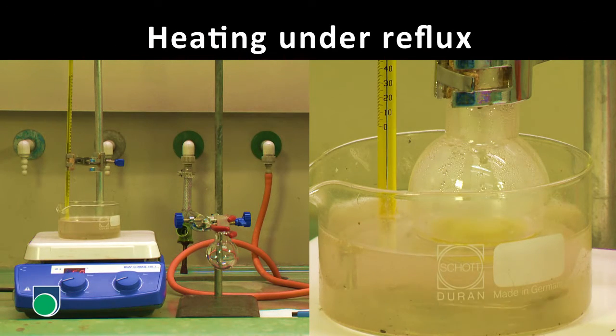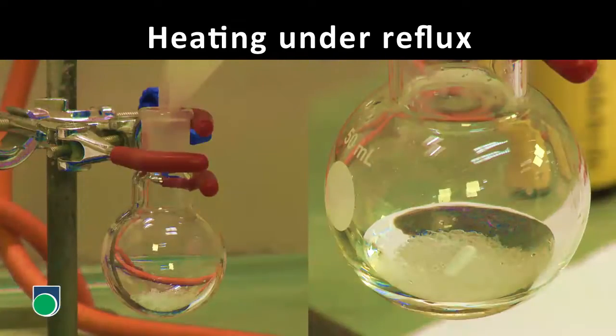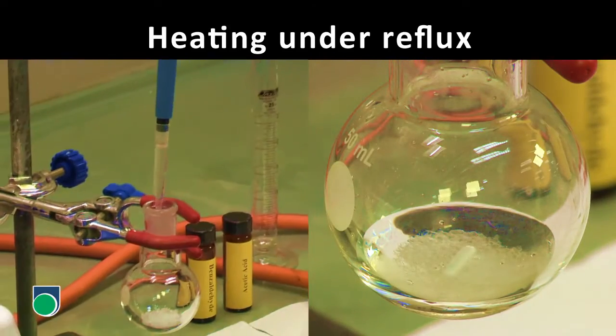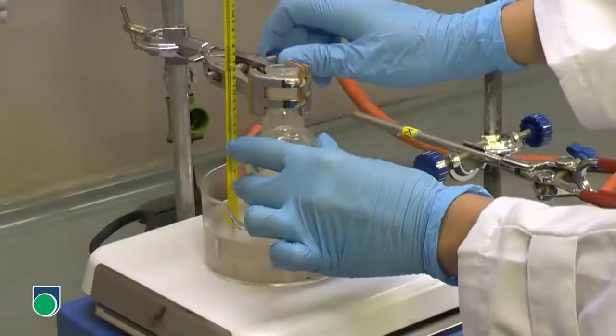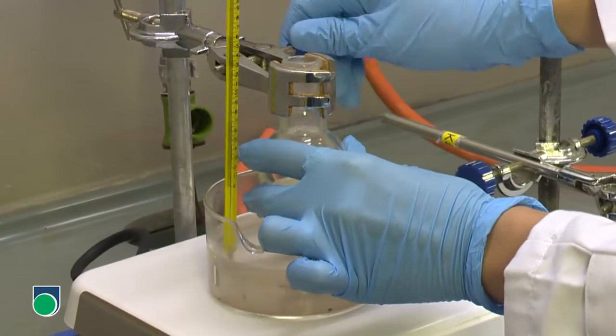Heating under reflux is often used in the laboratory. First, put all the reactants, solvent, and the magnetic stirrer bar in a round-bottomed flask. Then, clamp it carefully to the stand.